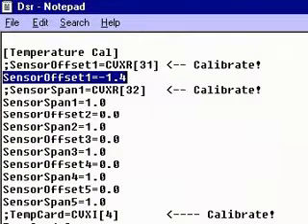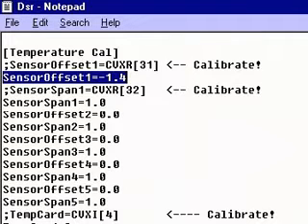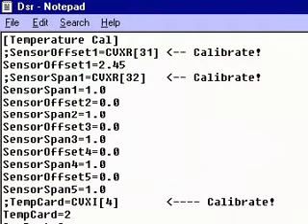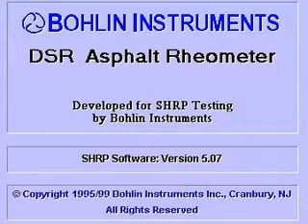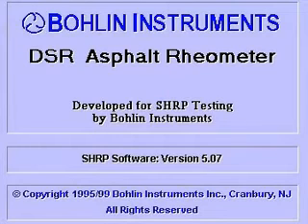For some DSRs, the temperature correction is made on the water bath controller itself. Always follow your manufacturer's instructions. For older versions of the Bolin DSR, open the DSR.ini file and scroll down to the line showing Sensor Offset 1. Add the temperature offset value to the existing value in the DSR.ini file and save the file. Reload the DSR software and verify the temperature calibration process. Repeat the process if required.